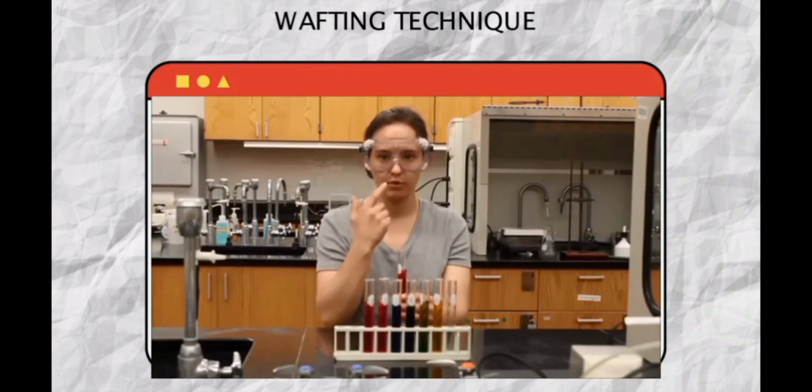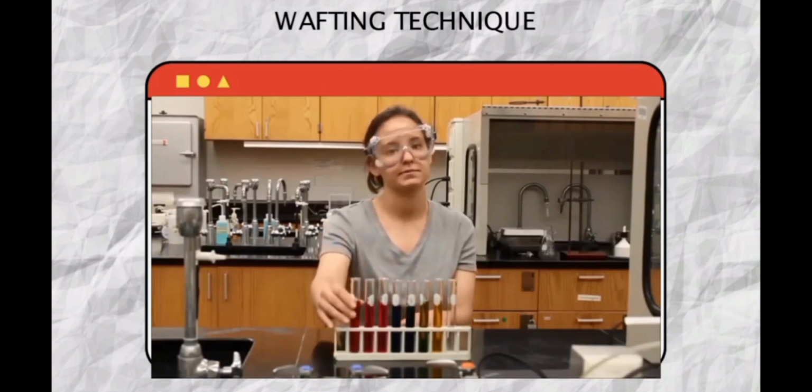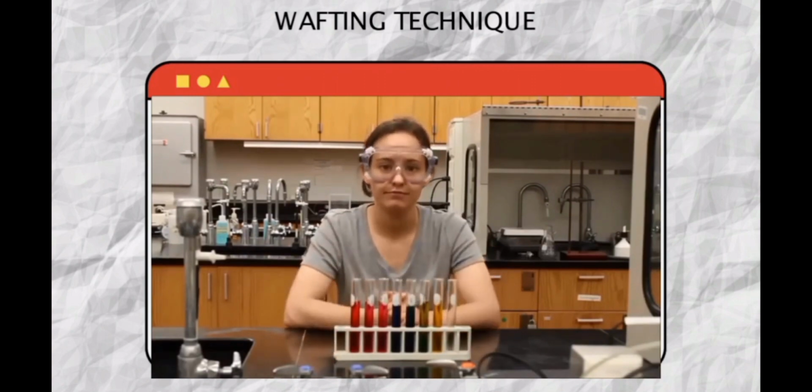However, make sure you never put it directly under your nostrils. It could end up damaging your respiratory system. Alright, you're good to go.